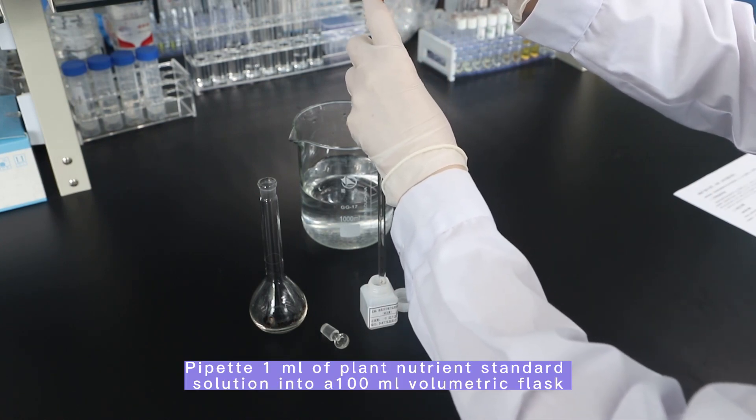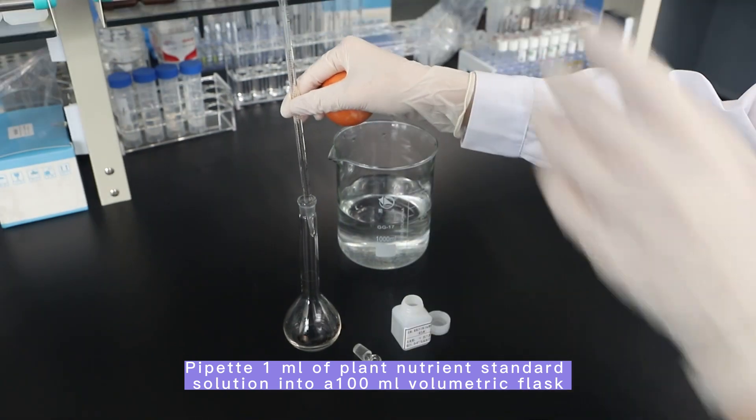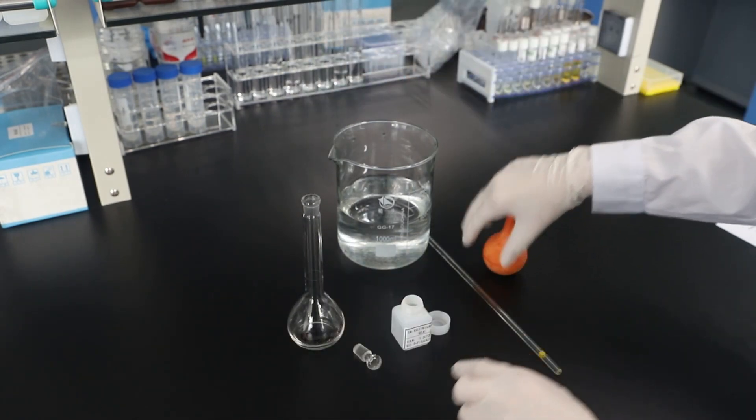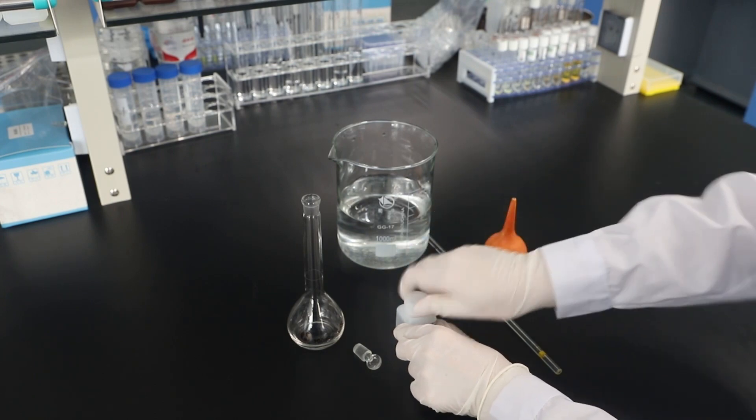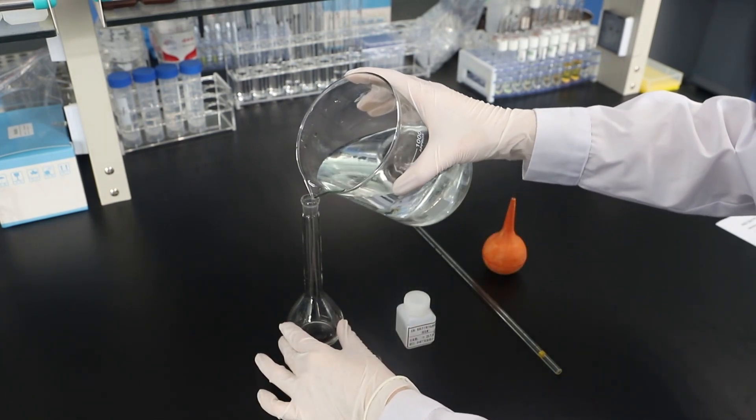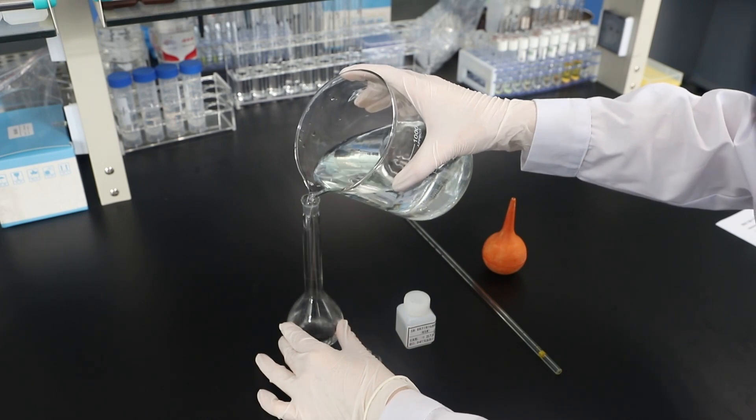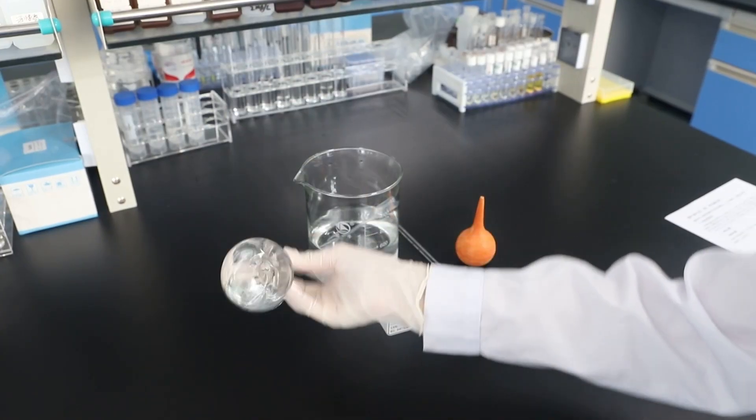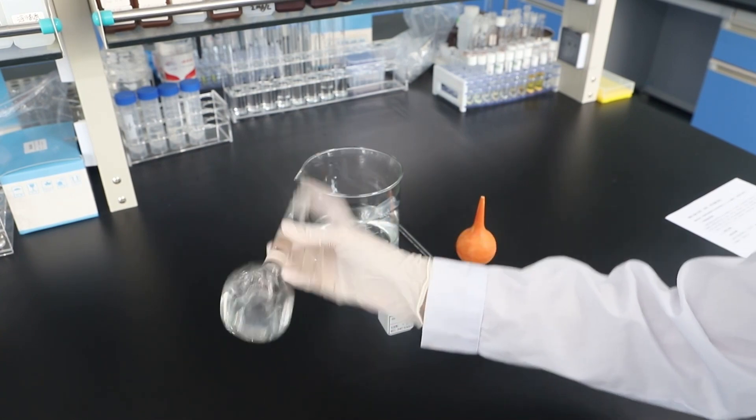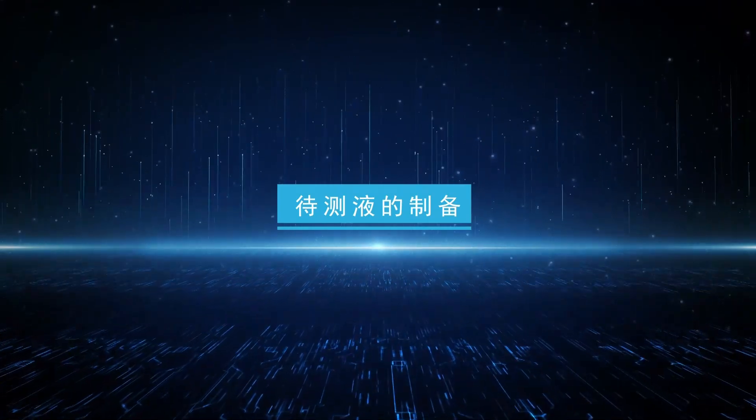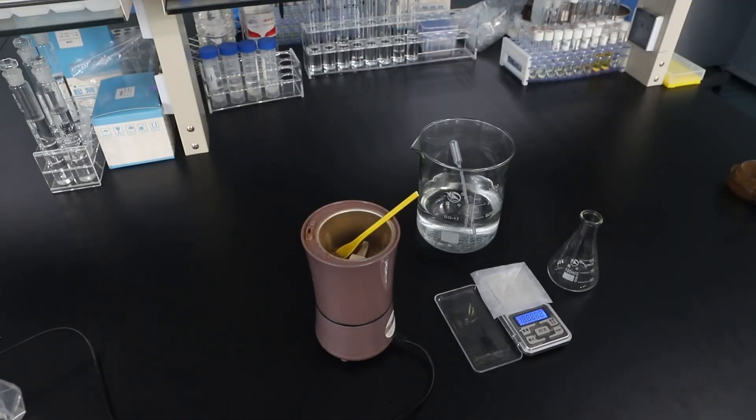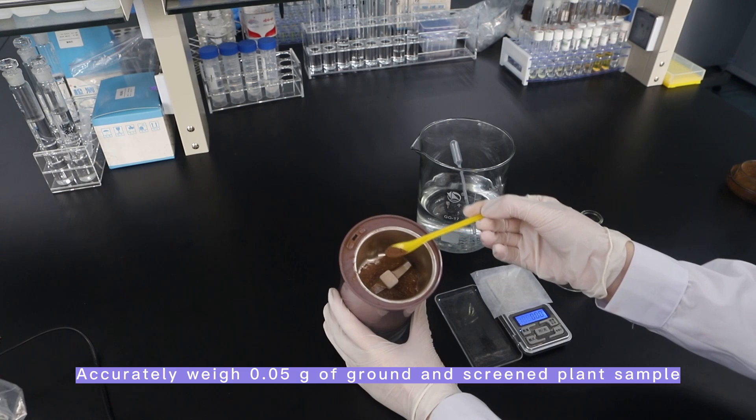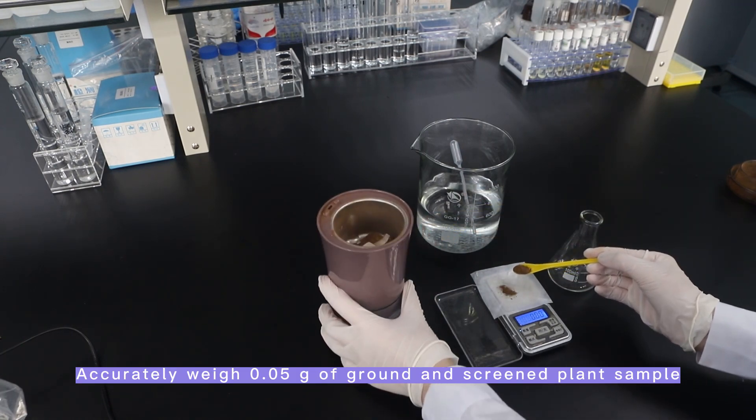Pipette 1ml of plant nutrient standard solution into a 100ml volumetric flask. Accurately weigh 0.05g of ground and screened plant sample.